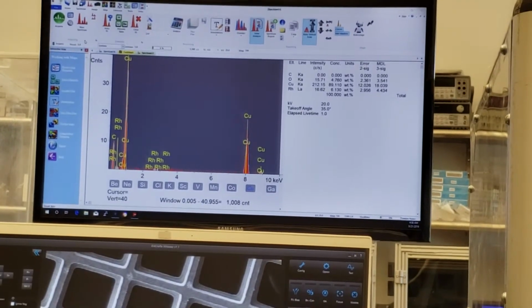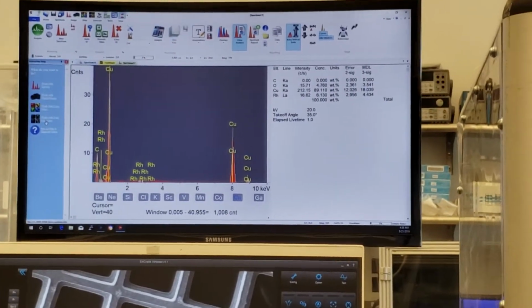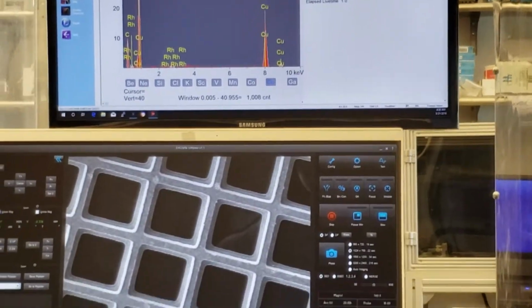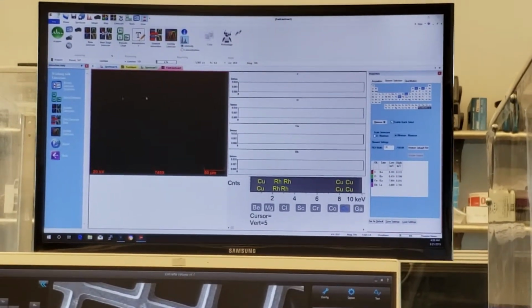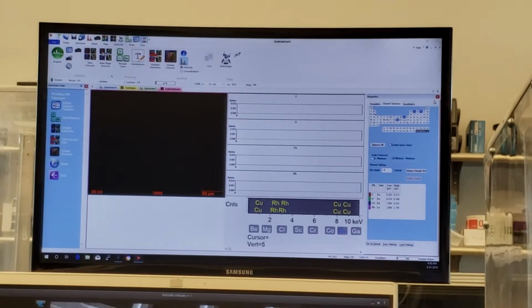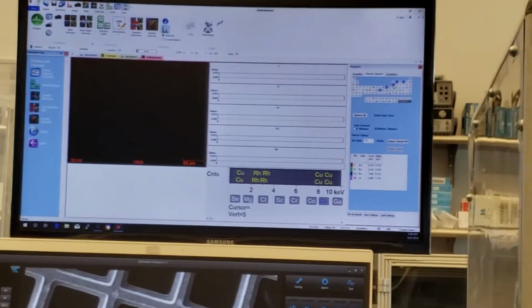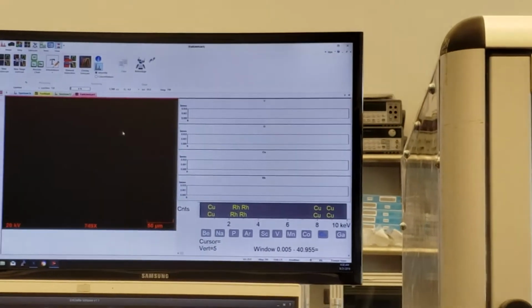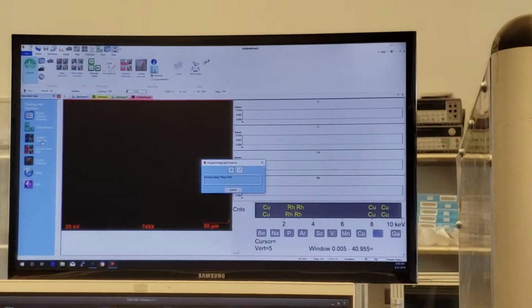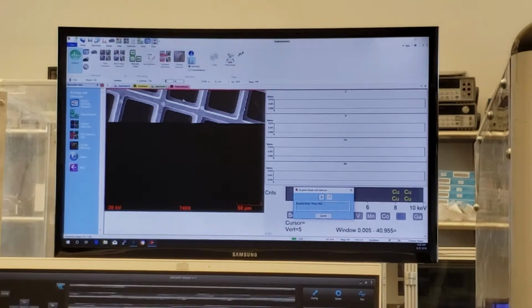Yeah. So anyway, we press on, interactive help again, let's go back, and then working with line scans is basically the same thing. Select the element you want it to line scan. So it's telling me what elements do you want me to line scan. Okay, I've already got them selected, so if I wanted to add aluminum, it adds AL as well, right? Or I can just remove aluminum, so I get rid of it, right? So the elements have been selected, and then realistically all I need to do at that point is acquire the line scan. So it's going to come down through, it's going to take a picture of it, and then I could draw a line, and it takes the beam right across that line.